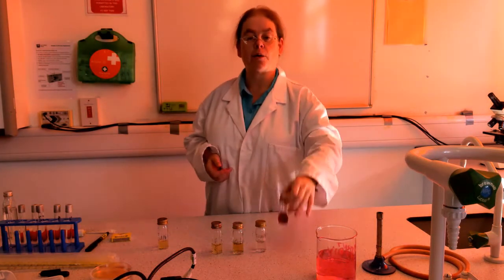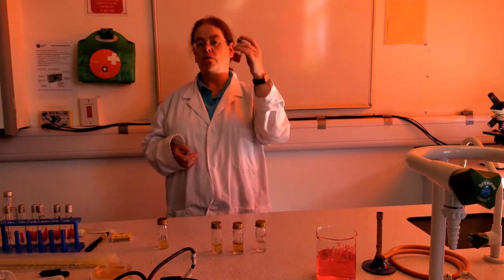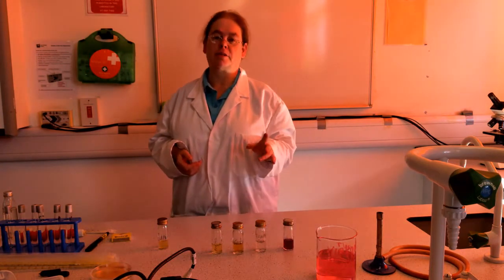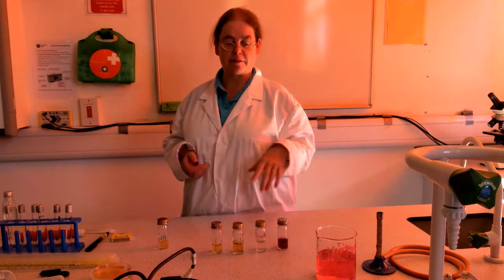And then, as I say, we have this selective medium, which is supposed not to grow all types of bacteria. I say supposed because bacteria don't always read the textbooks when we try these practicals, but that's the theory.